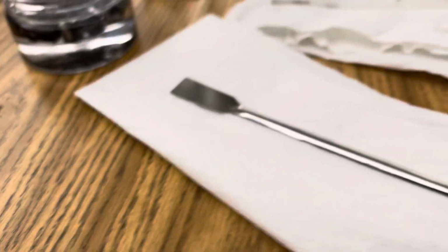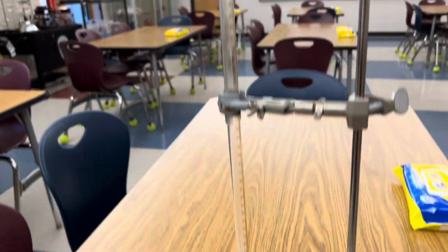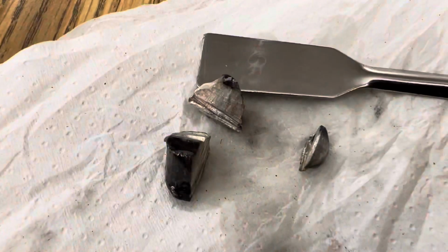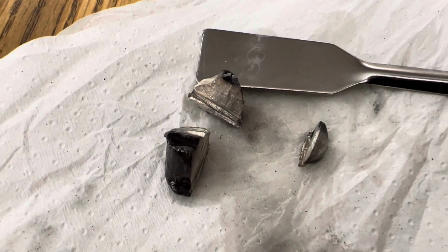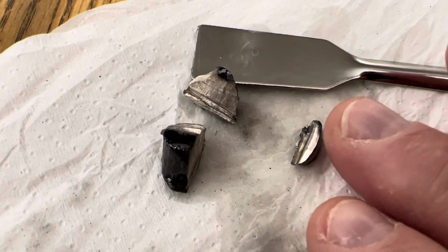in mineral oil, a spatula to cut my lithium, a dropper, and I'm going to use a pretty long test tube to contain this reaction. Here are a couple small pieces of lithium that I've cut. You can see after you remove that oxide layer how bright and shiny they are.